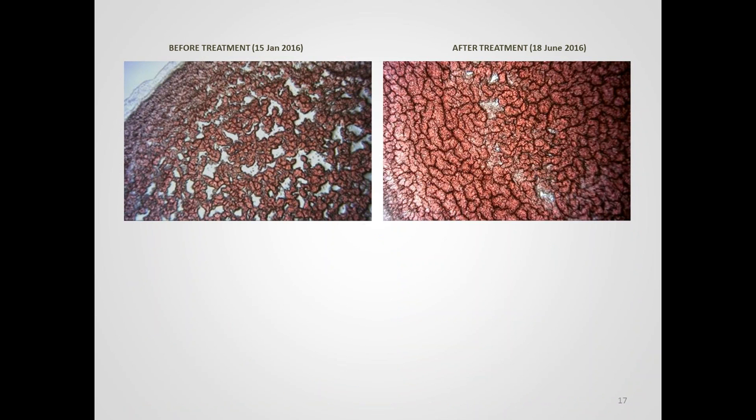All right, and just this lady's dry blood sample. So we also look at the amount of white in the dry blood sample and how much of the red blood has been displaced by these white areas. Now this type of displacement of the blood is actually linked to high levels of acidity in the system and high levels of inflammation as well.